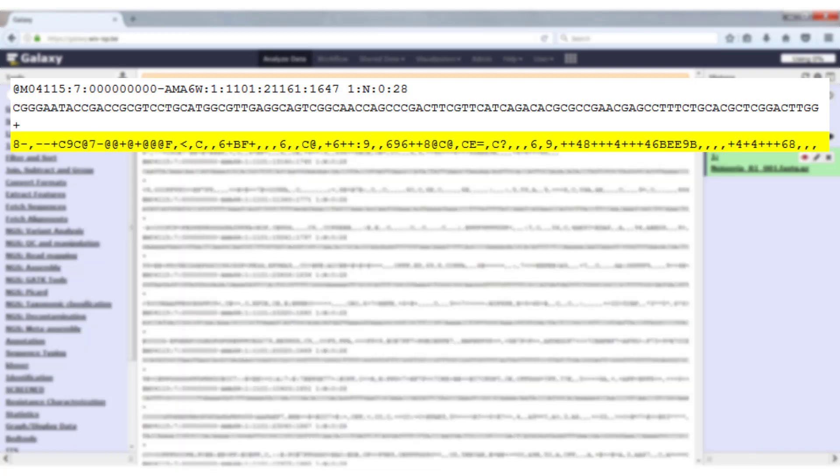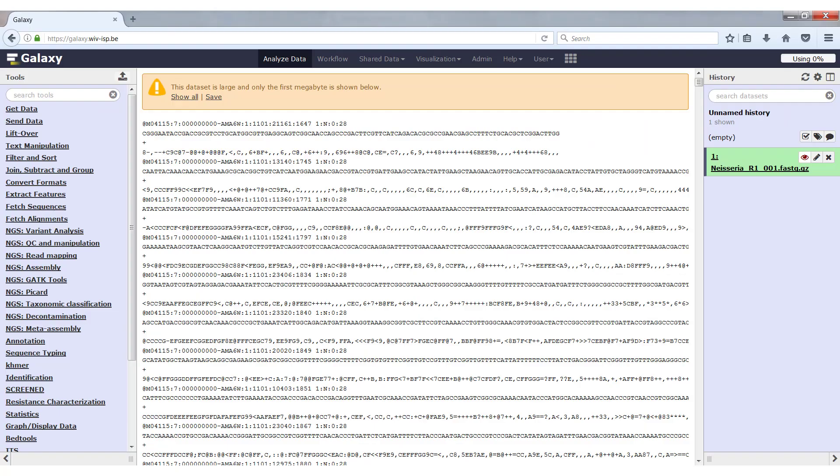In most cases you will never look at this file directly, but if you want some more information or are troubleshooting something in your experiment, you can always have a look at the raw data by either looking in Galaxy or downloading the file and opening it in another editor.